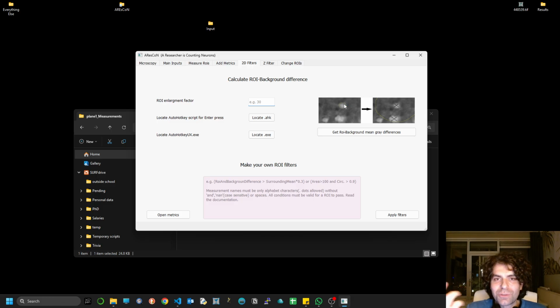And of course there will be mistakes, because when we have a large image, it's really hard to get a representative mean of a background noise. So what we want to do is to take a relative background, an enlarged region of the initial measurement that you have, 30 times, 40, 50 times, whatever. So it's a relatively small region surrounding your cell, and this is more trustworthy as a means of background.